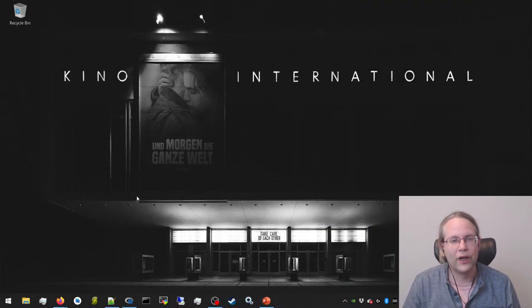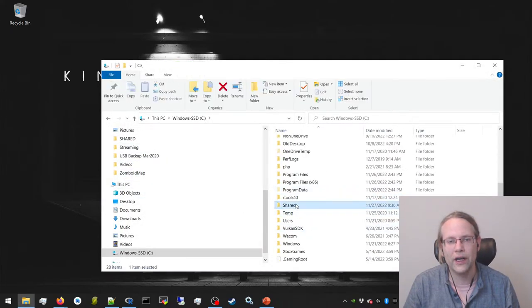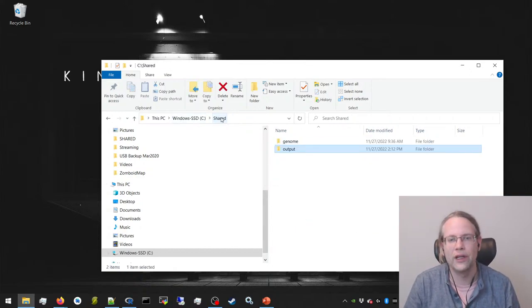All right, so when I look into my shared folder, I'm just going to go to C, I'm going to go to shared, then you see the output. So this is just a copy. And of course, there's some other files which we will create very soon. So I'm just going to delete those.